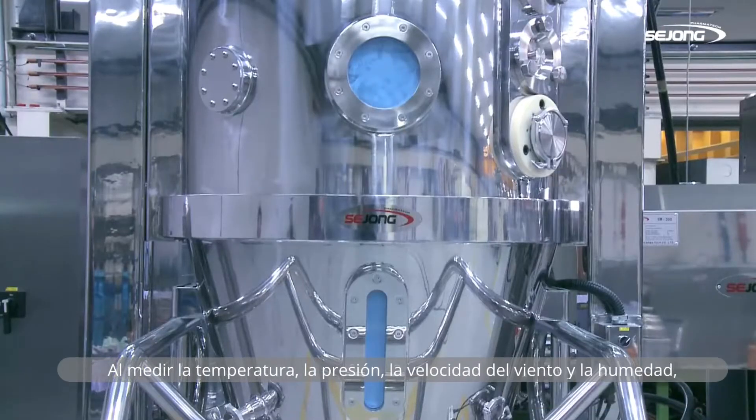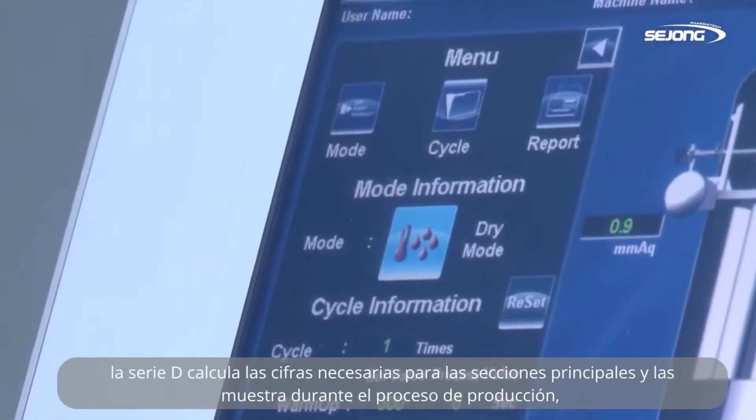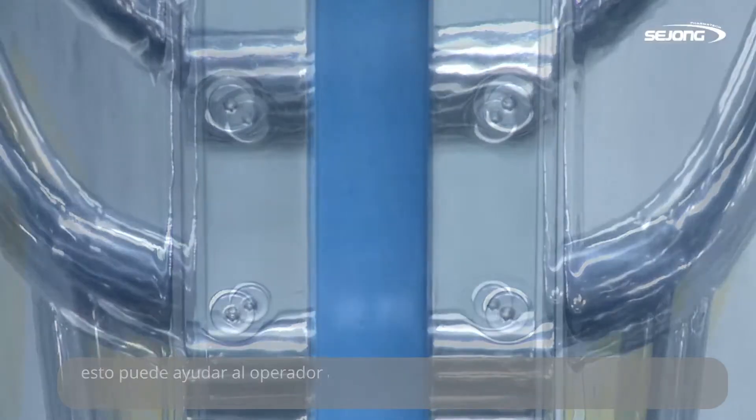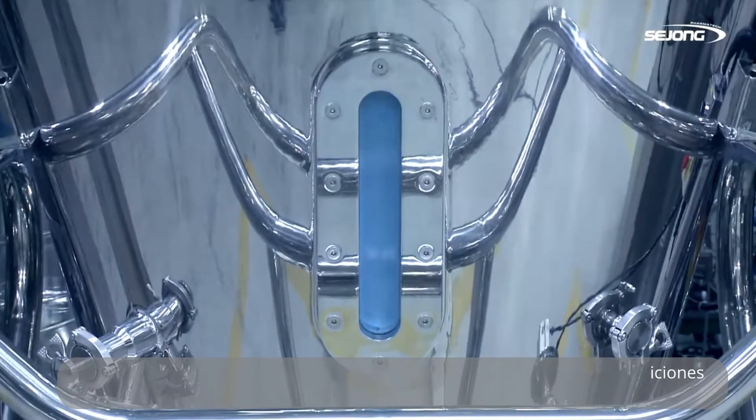By measuring temperature, pressure, wind speed, and humidity, D-Series calculates the necessary figures for main sections and displays them during the production process. This helps the operator find and maintain the best working condition.